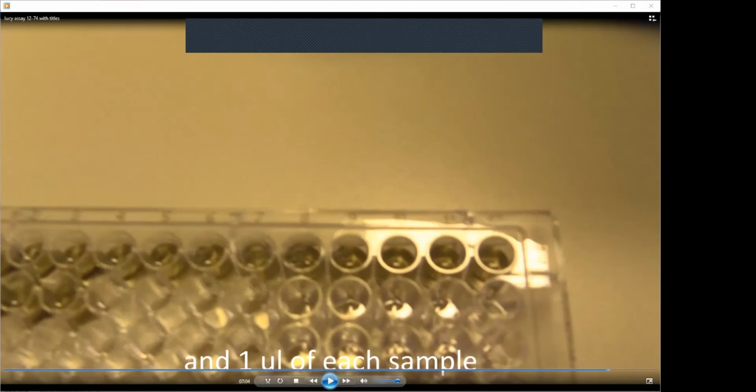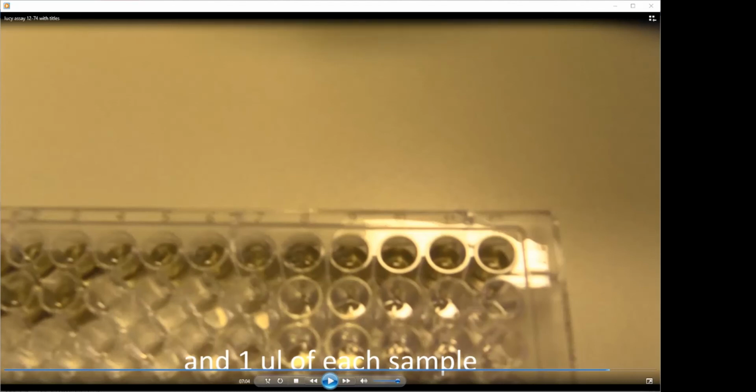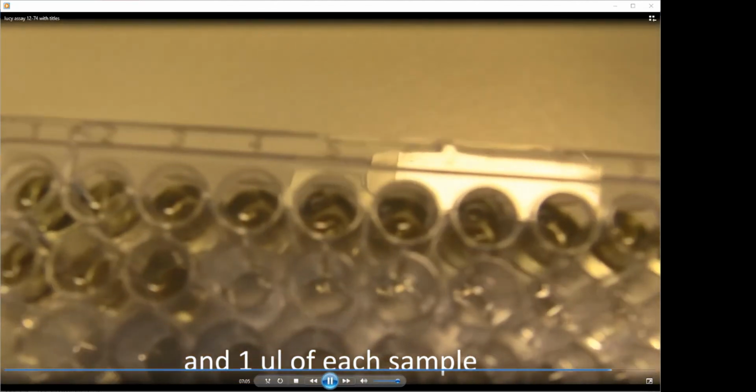In the future, I have to think about a different technique for measuring the protein concentration to avoid the interference of the lysate buffer. But as a matter of principle, you can see that after 10 minutes of incubation, there was an obvious change in color from this brownish to blue.